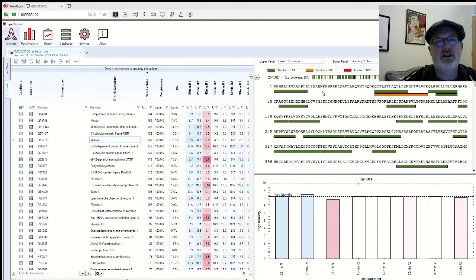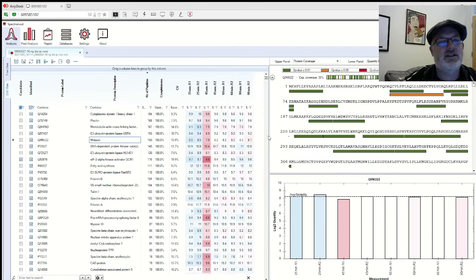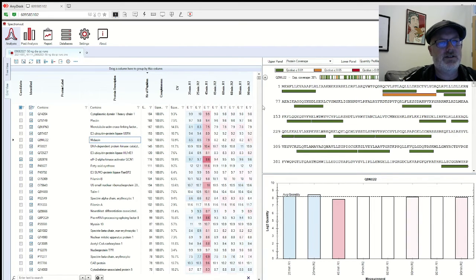Okay, so we've identified 150 peptides. Pretty awesome. Completeness is 100%, of course, because it's very abundant. You would expect to see it on all your replicate runs. CV is pretty low. Usually with cell culture we expect a CV around 15 to 20%, maybe a little bit less than 20%. These are standards, so the CVs are going to be low, but the CV will vary by protein.